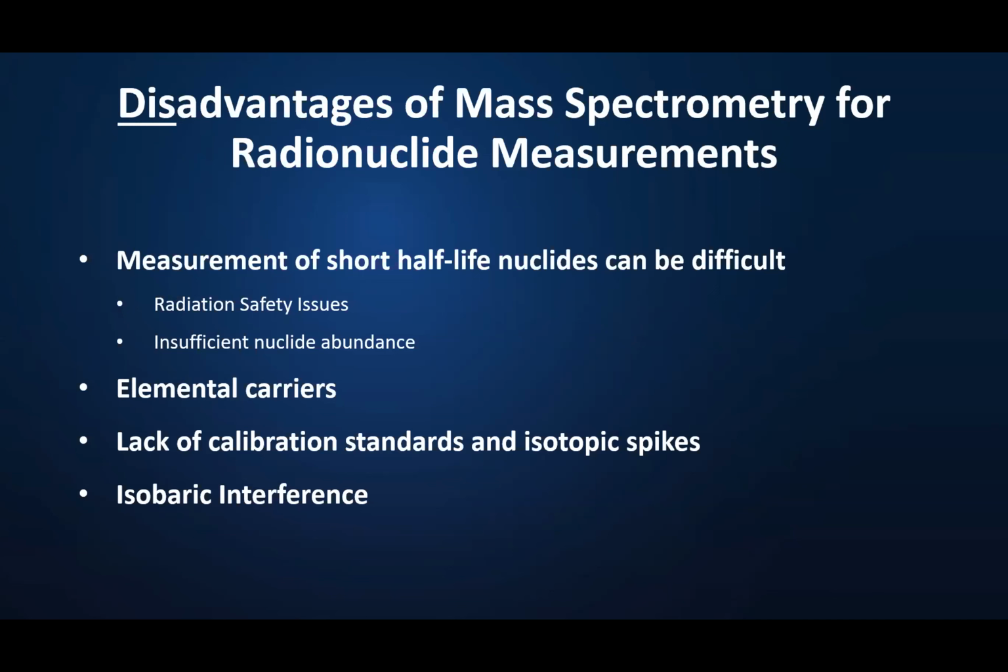I think one thing that would be useful for the radionuclide metrology community to know is what types of radioisotopes and in what forms the mass spec community would like to see us work to develop, to improve this particular potential disadvantage, this thing that's lacking in using mass spec for radioactivity measurements in general, not just radionuclide metrology.